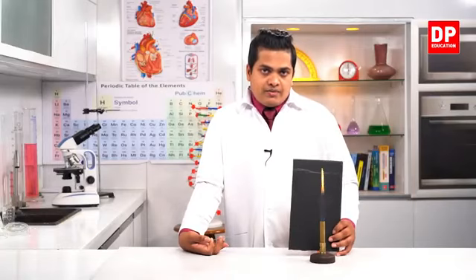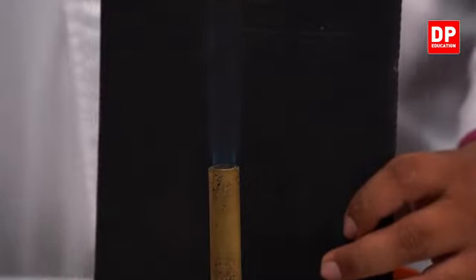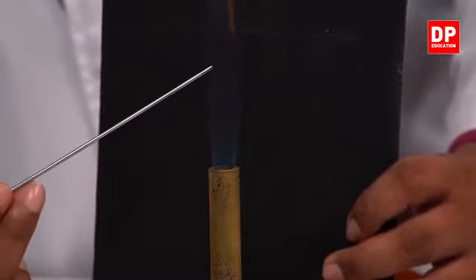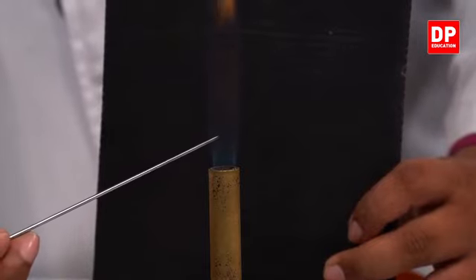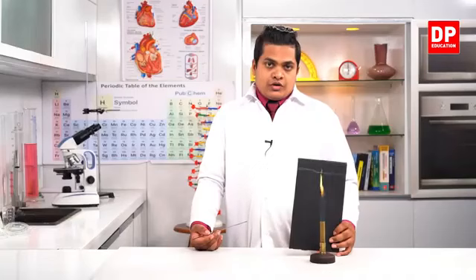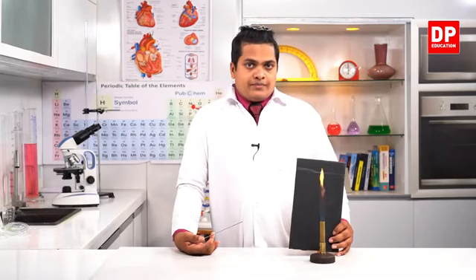So once again, we'll memorize what the zones are. In the outermost area, you can observe the invisible zone. Then after that, the light blue zone, the dark blue zone. In the middle, in here, you can observe the non-luminous zone. So in a Bunsen flame, we can observe these 4 zones very clearly, right?